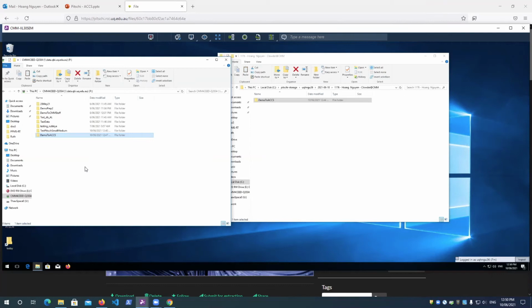How do you deal with massive, like terabyte single files that are being added to? You're not doing time lapse, but you're doing serial sectioning that are growing over time. You don't want to write those out as they're growing, I assume. So with that, there's another flow that I don't show here that only syncs at midnight. I'm not sure whether that works for you. Maybe, but some machines we shut down for stability. It's better to restart them.